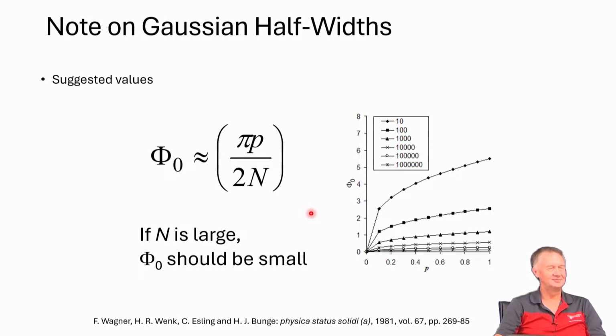Right? So will our calculations be different? Yeah, maybe a bin size of 5 by 5 by 5, which is pretty typical. Probably won't be too much difference, maybe a little bit of spreading. If you're selecting 1 degree versus 5 degrees, your texture will be different. Could be slightly different, yeah. Initially, if we don't know, then how to make out?